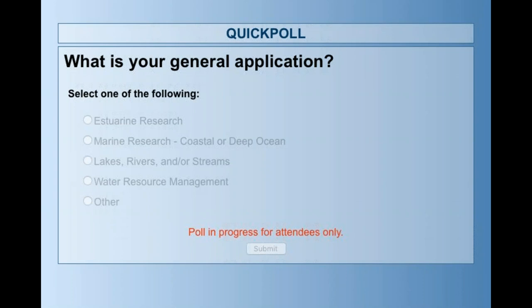One more thing related to that is that pH electrodes, glass electrodes, should never be allowed to get dry. For those doing intertidal studies or intermittent streams, anytime you expect the water level to go down, you should consider deploying the logger in a place that allows the glass bulb to stay under water. If it gets dry, you should recondition and recalibrate it. If you had an extreme low tide, you'll be able to notice that if you've used the water detect nodes. You might be able to see when the water went away and for how long. If it was for like 10 minutes, you should probably be fine. But if it was for more than that, or even hours, then it will require recalibration and rehydration.